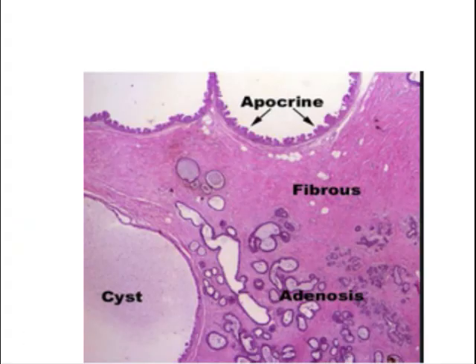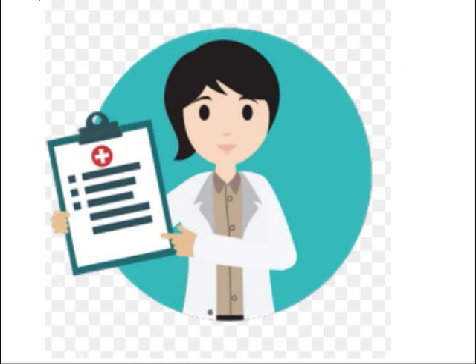Under the microscope, the following features were noted: presence of cysts, including a large cystic area. Some cysts are lined with apocrine cells. There was also fibrosis and adenosis, which is proliferation of small ducts.